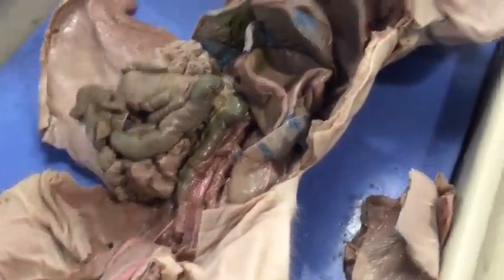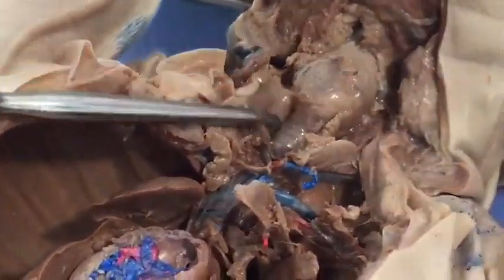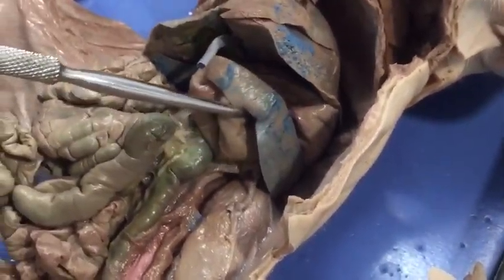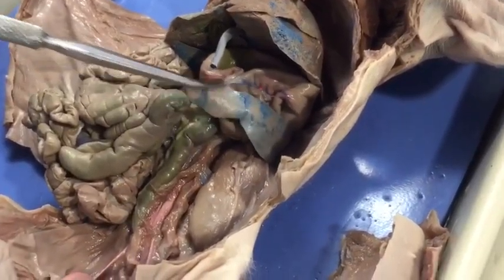Up here is the thyroid. The thyroid takes in iodine from a lot of the food that the pig eats, and then converts it to thyroid hormones. Then the spleen filters blood, and old red blood cells are recycled there, and white blood cells are stored. The spleen also fights bad bacteria that come into the body.